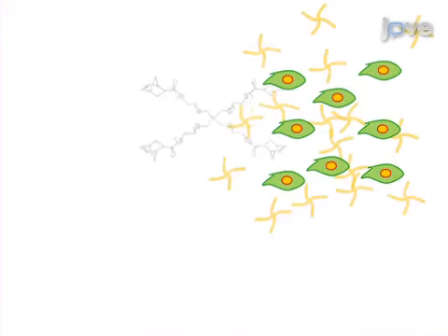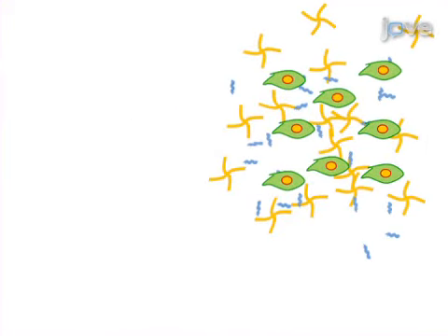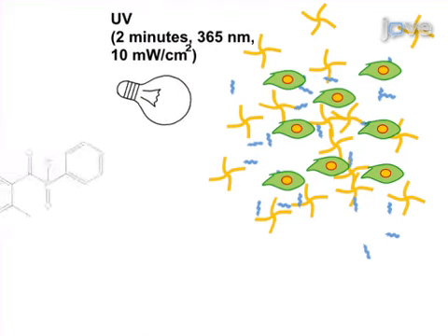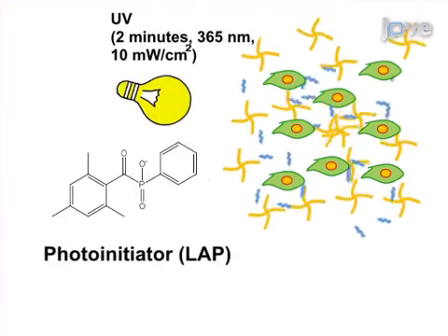This is accomplished by first mixing the Min6 beta cells with a 4-arm PEG-norbornene macromer and an enzyme-sensitive peptide crosslinker. The cells are then encapsulated using free radical-mediated thiol-ene photopolymerizations to form a hydrogel.